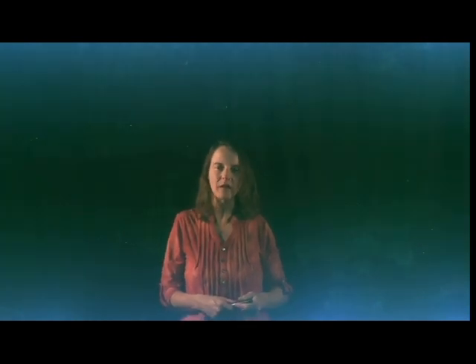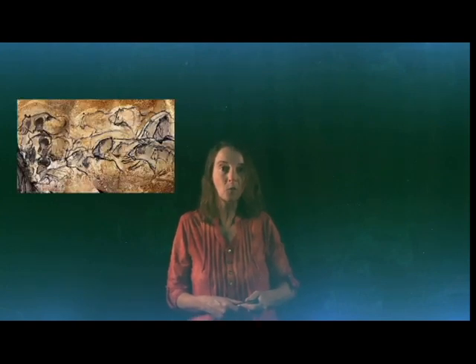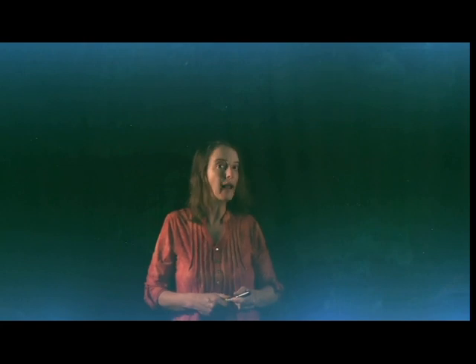Today's topic, the chemistry of art. Art and chemistry have an interwoven history going back to the creation of some of the earliest forms of art, cave drawings from some 40,000 years ago. In the lab, we are going to synthesize two different pigments, Prussian blue and barium white.